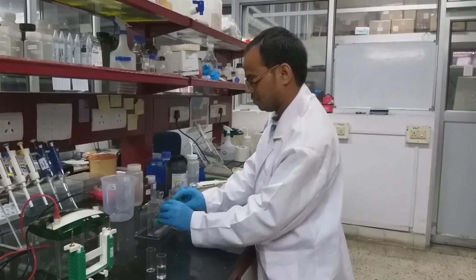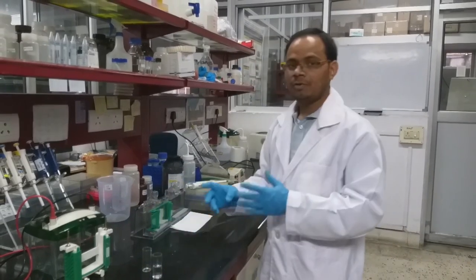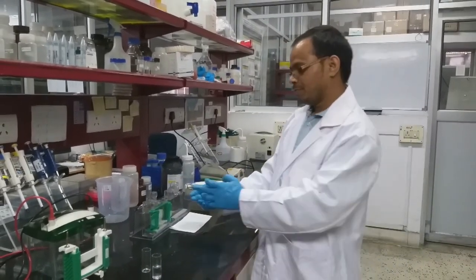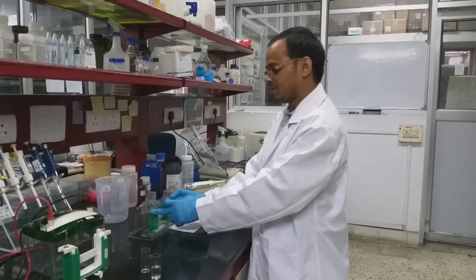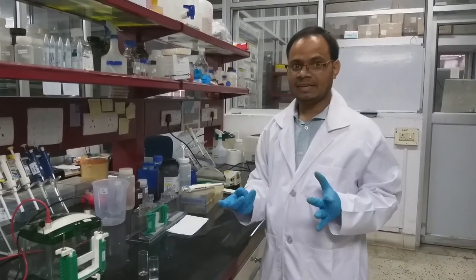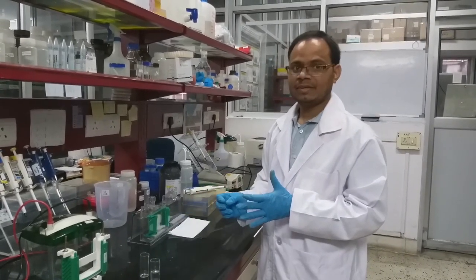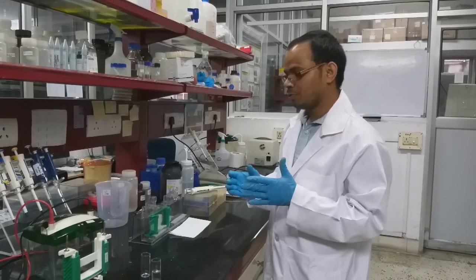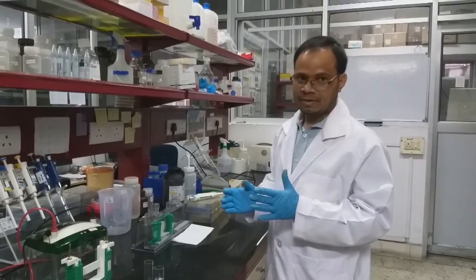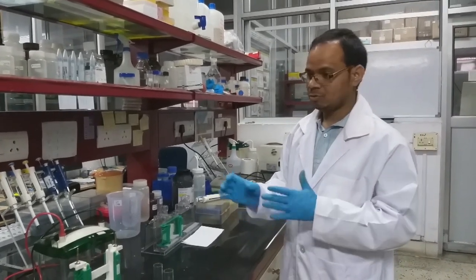Then we are going to keep this. So we have to check if we perfectly set up this one, then there should not be any leakage. But if there is any leakage, your resolving gel may leak out and you will get nothing. So in that case, we have to check it prior to pouring the gel, whether it is okay or not.